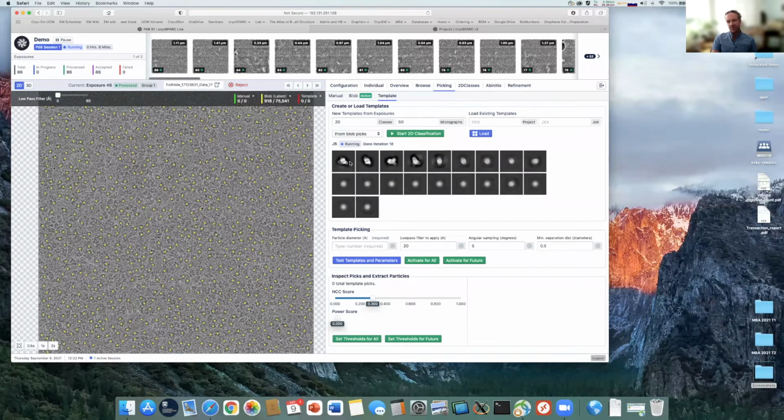Often aldolase, it's a tetramer, and it ends up in the ice such that one of the arms of the X shoves up into the ice and denatures. So although it's a tetramer and we refine it using a D2 symmetry, the actual particles themselves, often one of the subunits is a little bit misfeatured. Okay, so we've done that.